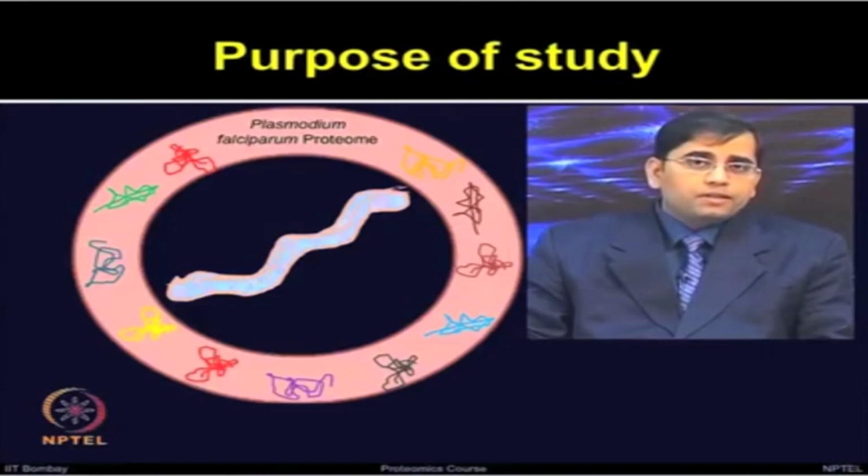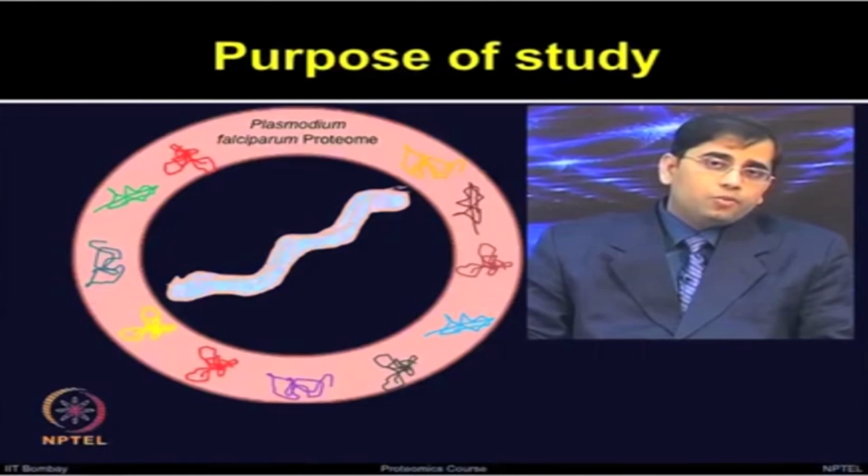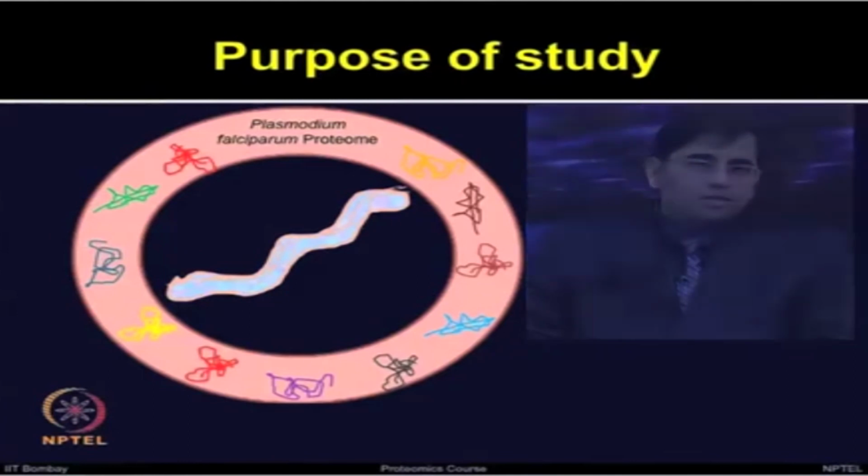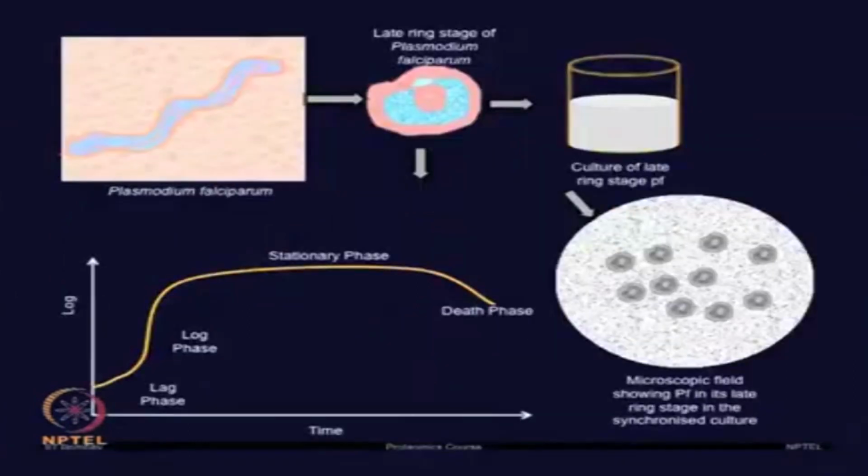So, certain proteins were found to be commonly upregulated due to both of these drugs, and certain proteins have different patterns. But before looking at the proteomic alterations, the authors first determined IC10, IC20, IC50 and IC90 values for both the drugs ARM and LUM.